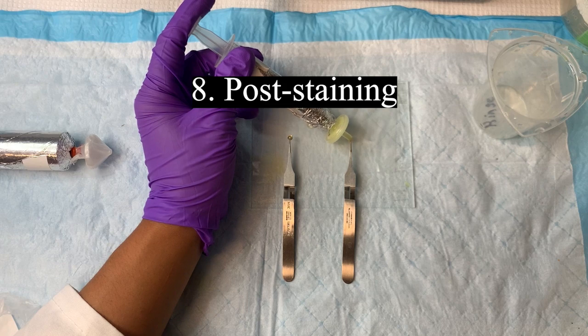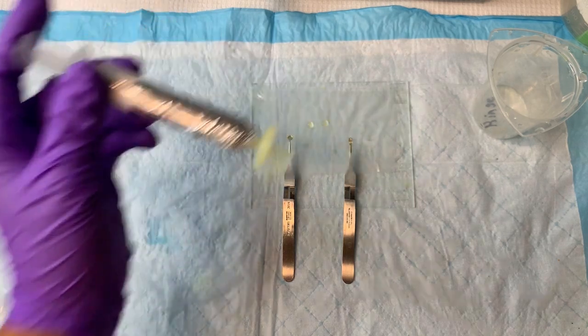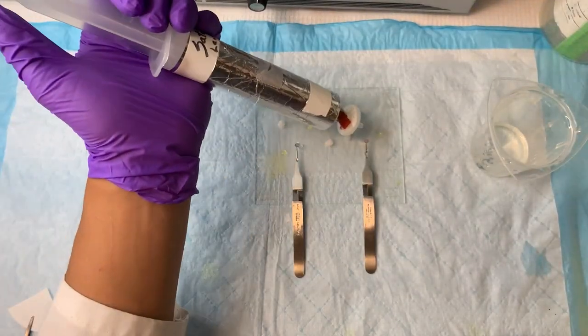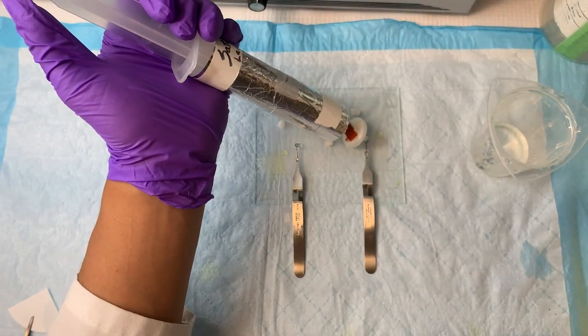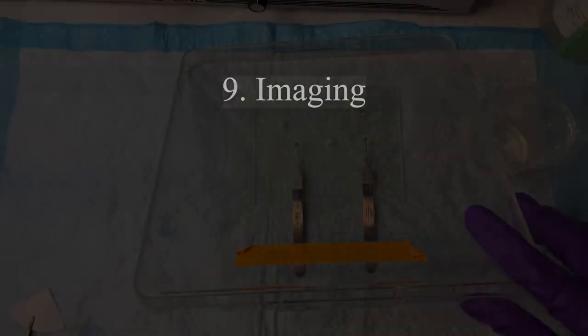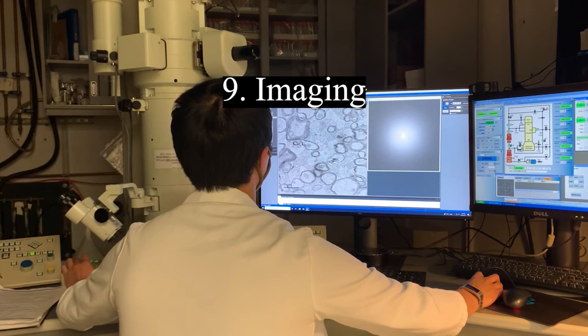When mounted, the sections are stained once again with the aforementioned uranyl acetate and with lead citrate, which interacts with proteins and glycogens to further enhance contrast prior to imaging. The sample is now ready for TEM imaging.